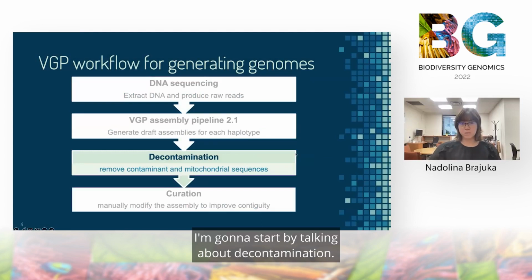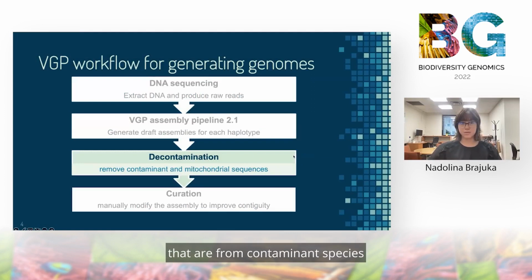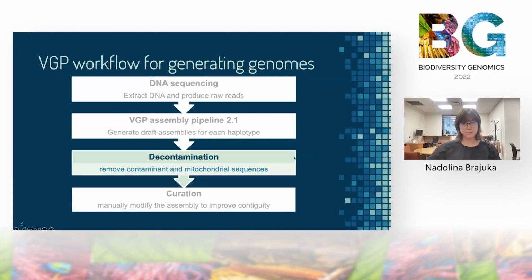I'm going to start by talking about decontamination. The goal of decontamination is just to remove any scaffolds that are from contaminant species or are from the mitochondria, because we assemble the mitochondria separately.